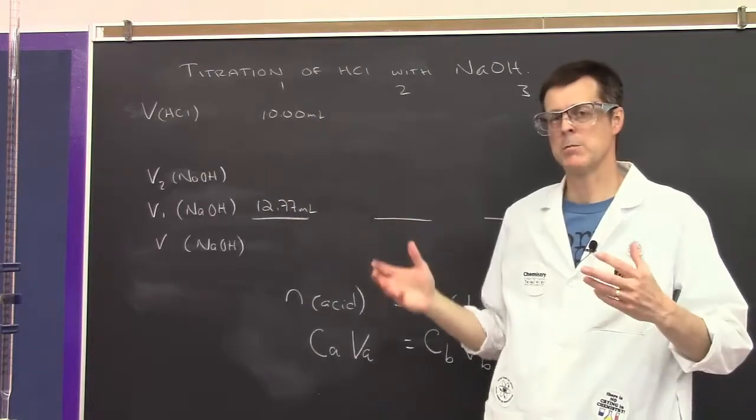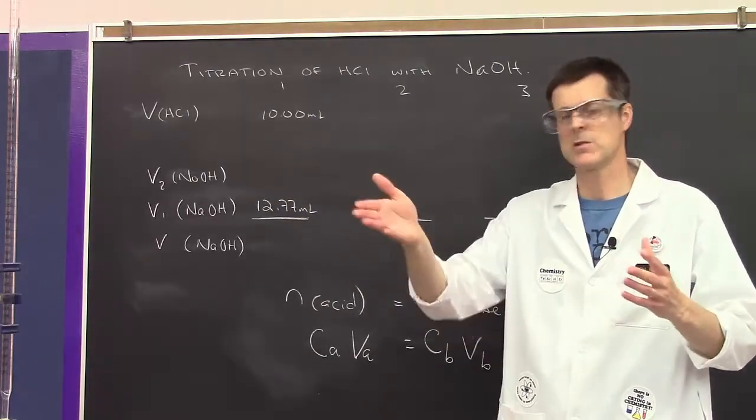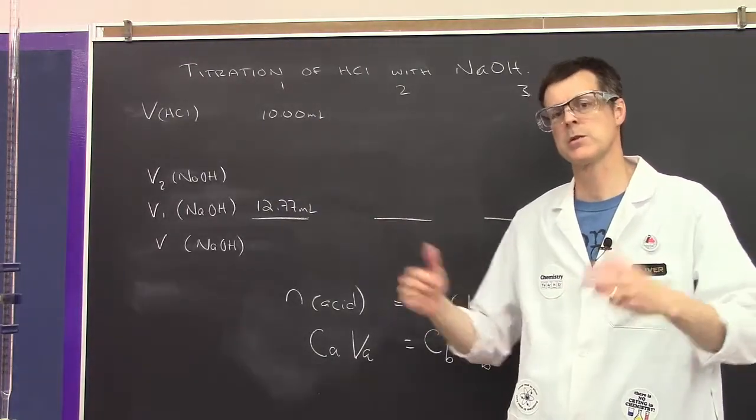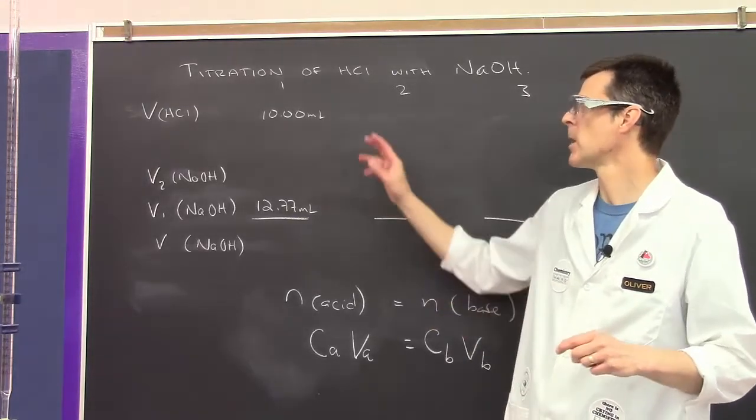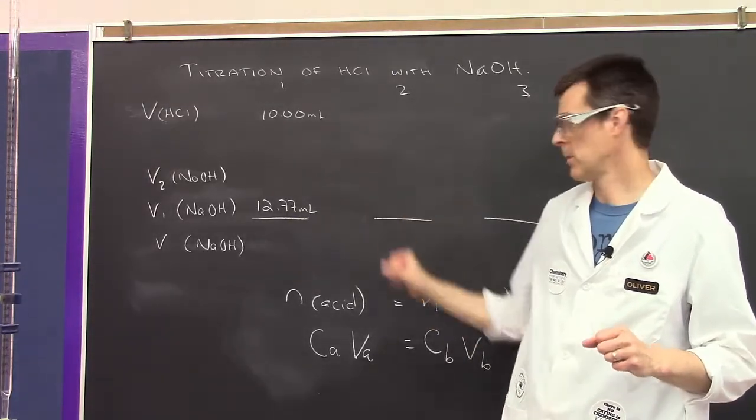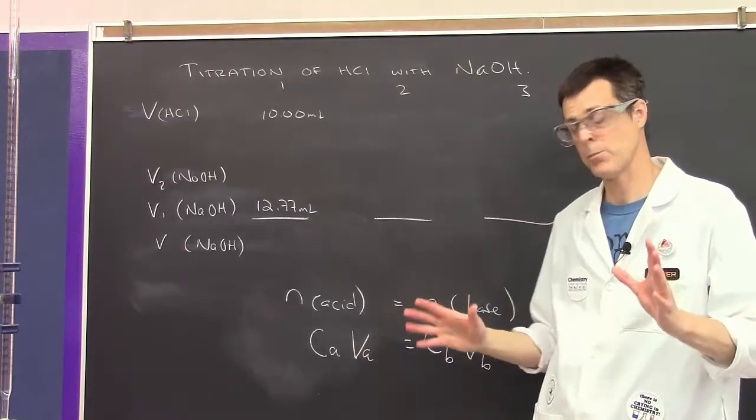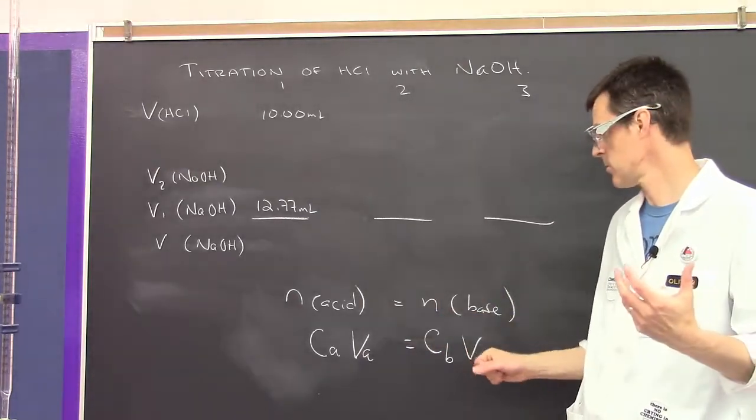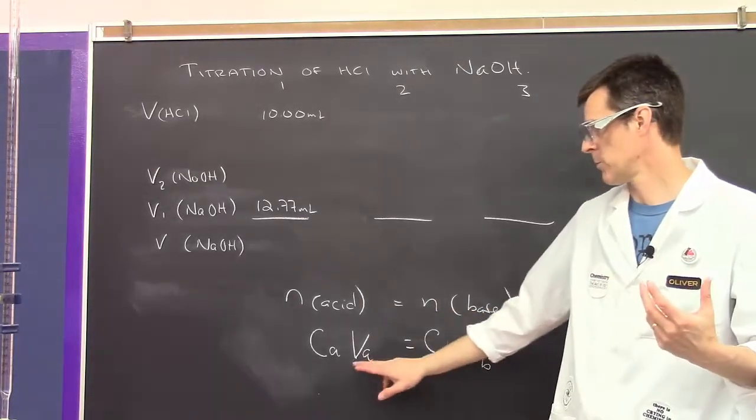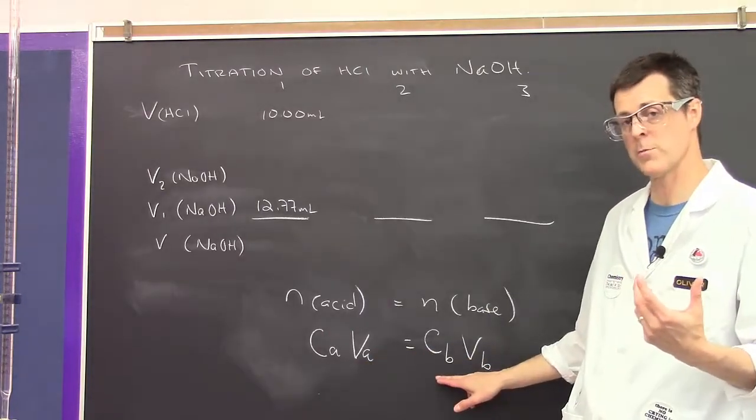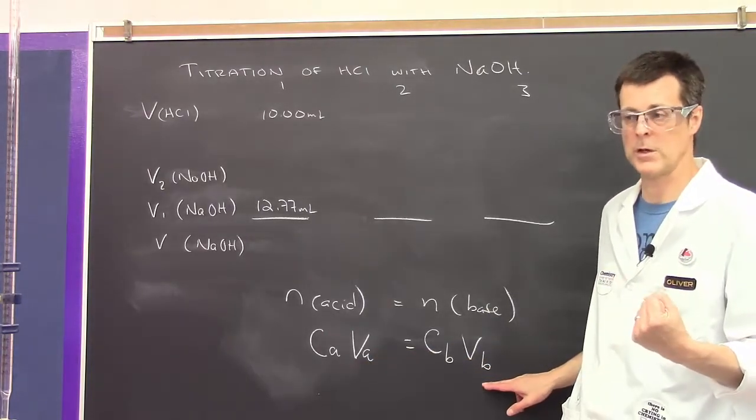I'm going to start with 10 milliliters, and if it doesn't take much then maybe I'll go up to 20 to give it a sporting chance. When I'm done with my measurements, I'll know the volume of the acid, the concentration of the base, and the volume of the base.